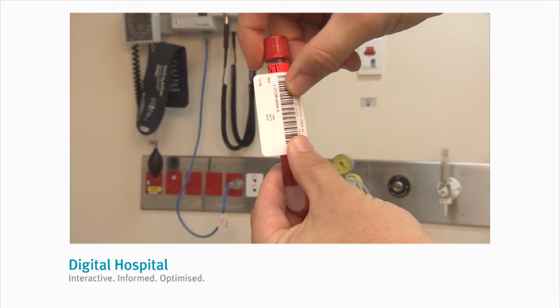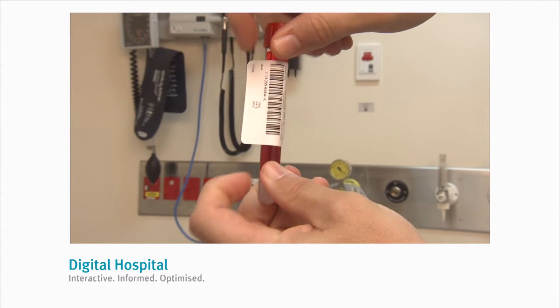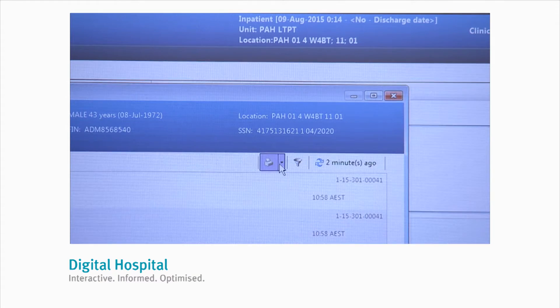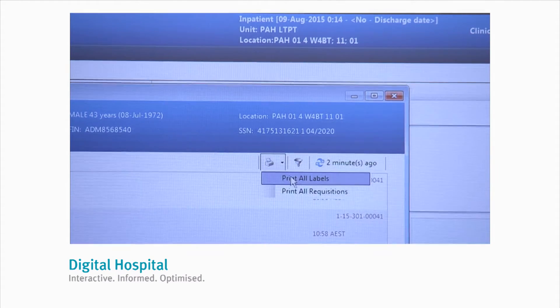When affixing the label, it must be horizontal and straight with the barcode at the top. If you need to reprint the labels, you can reprint them from this screen using the steps that we have just outlined.